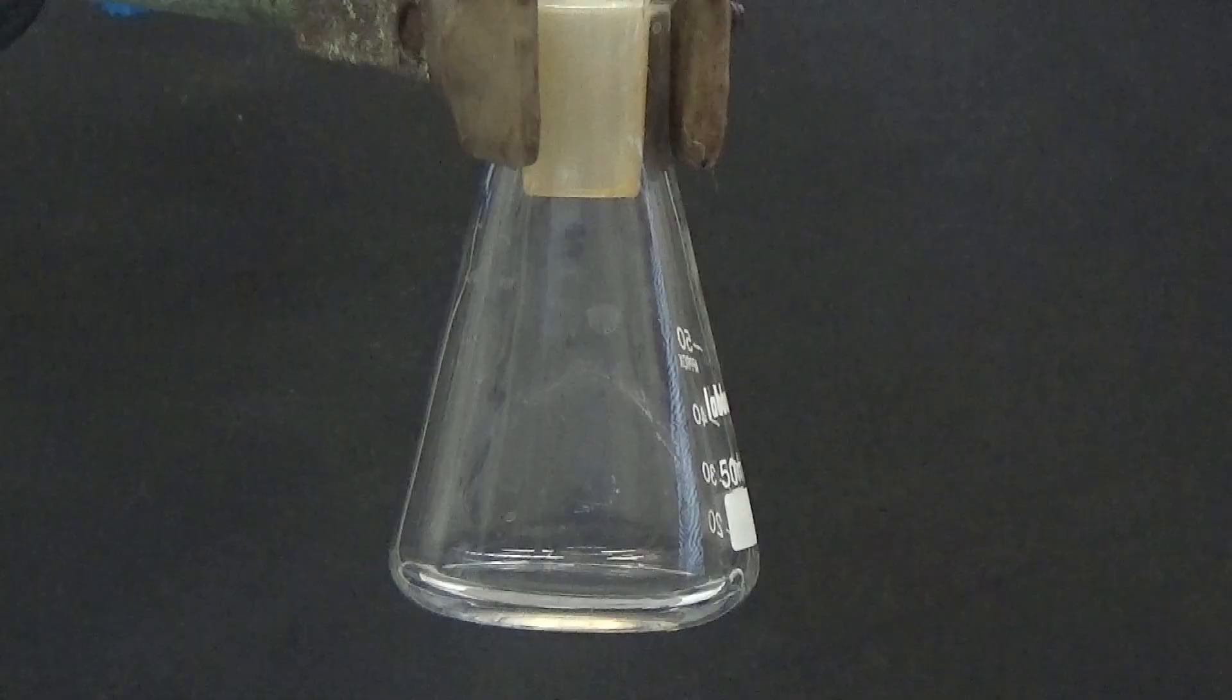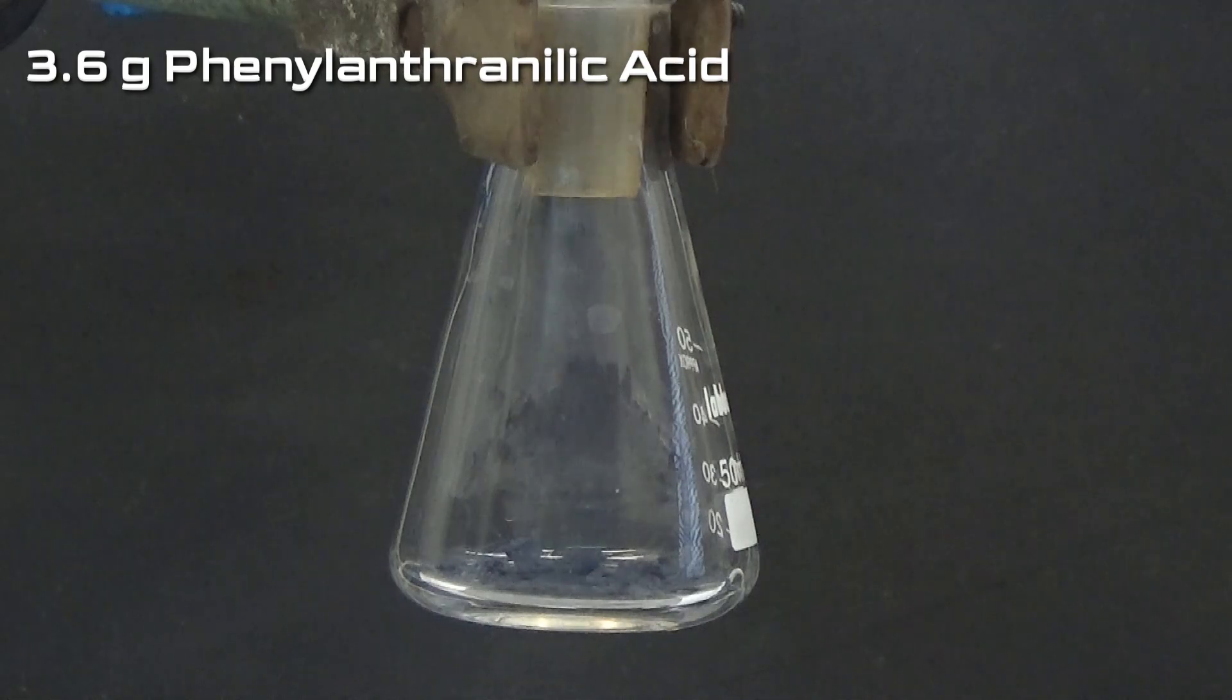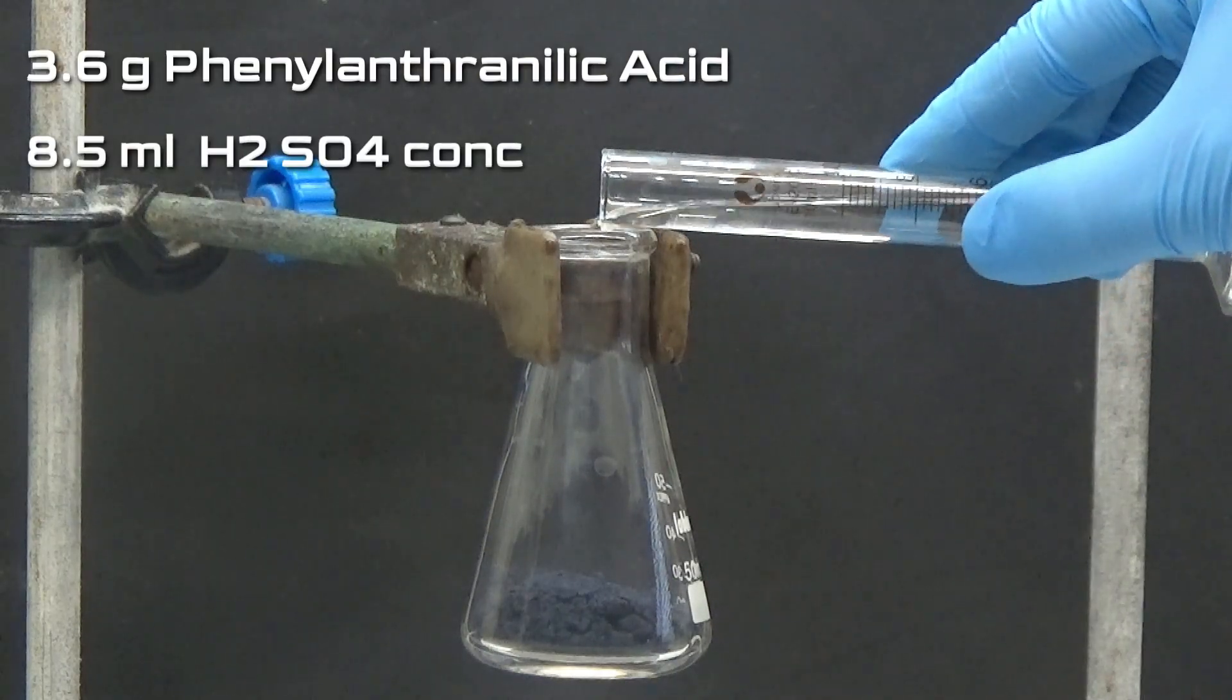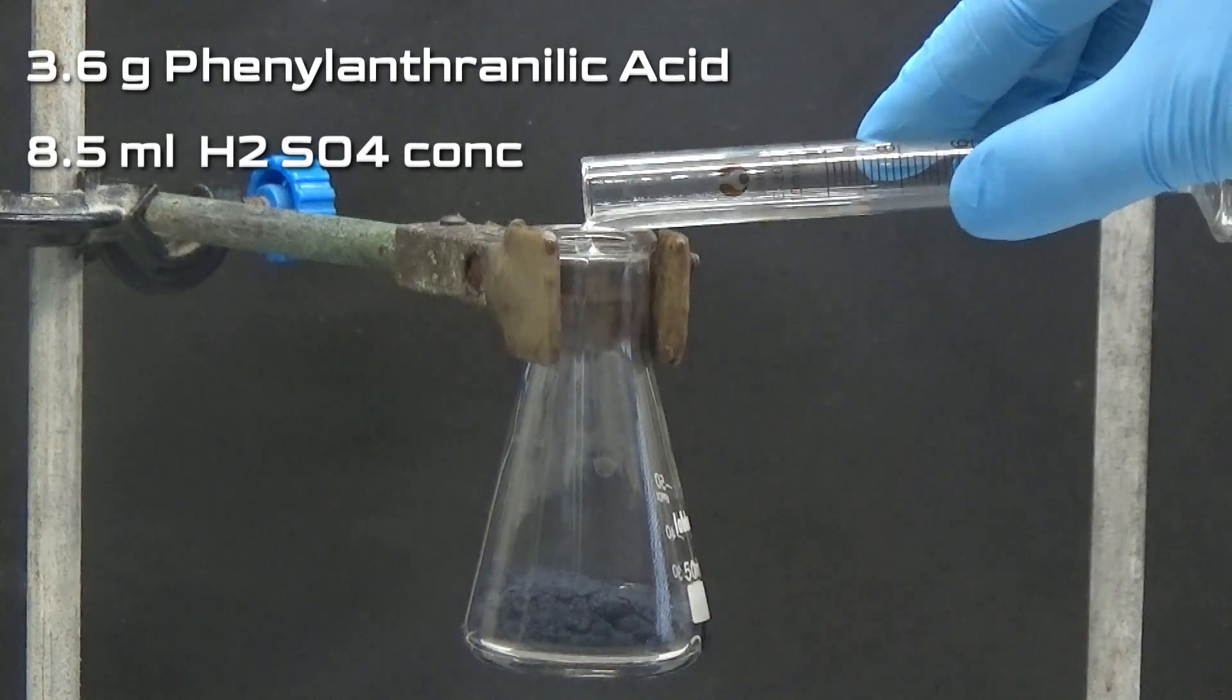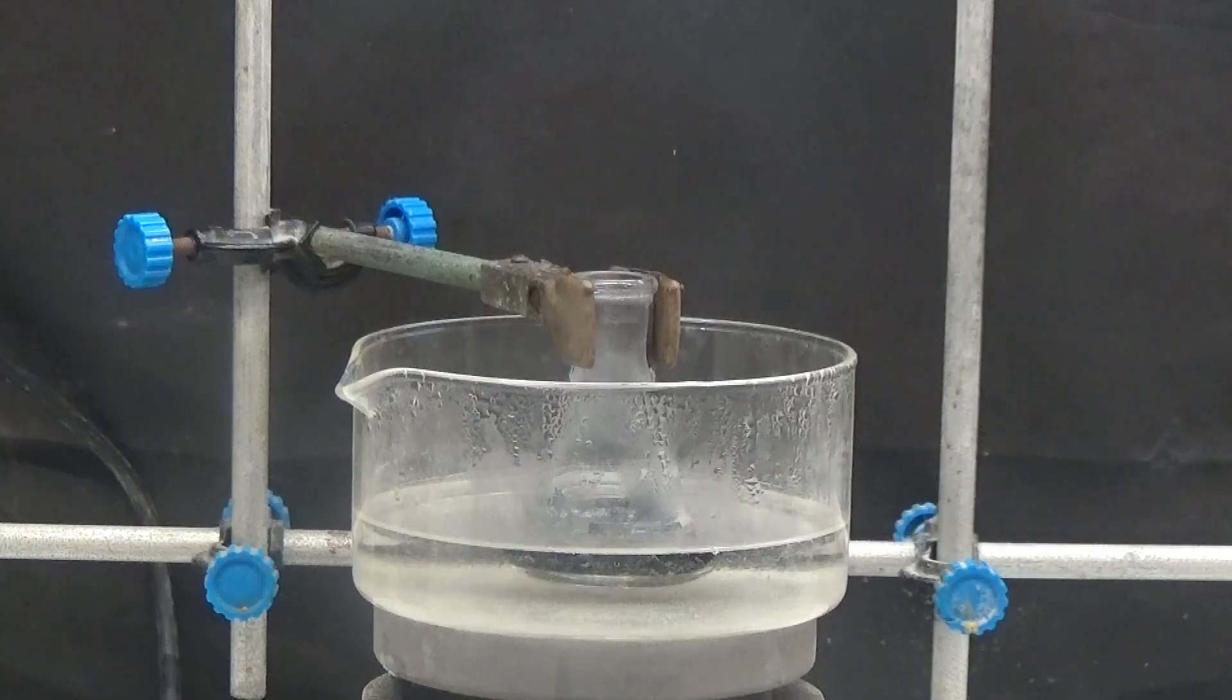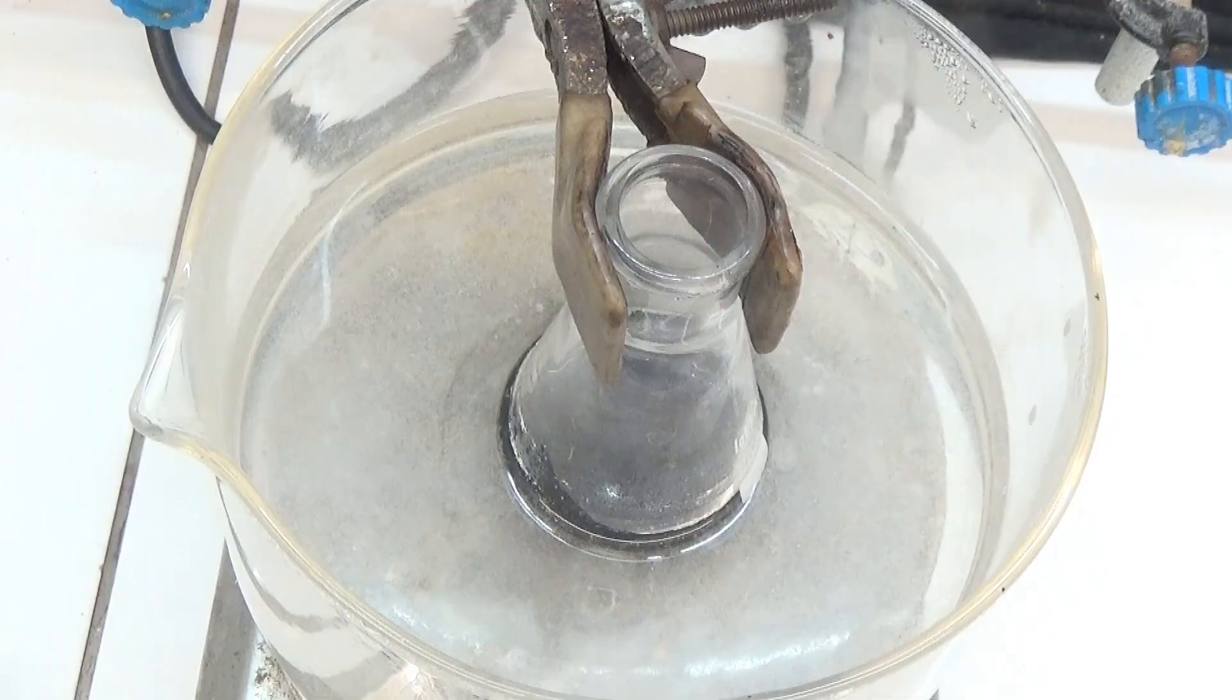In an Erlenmeyer flask of 50 milliliters we put 3.6 grams of phenylanthranilic acid and slowly add 8.5 milliliters of concentrated sulfuric acid to heat during 4 hours in a water bath.